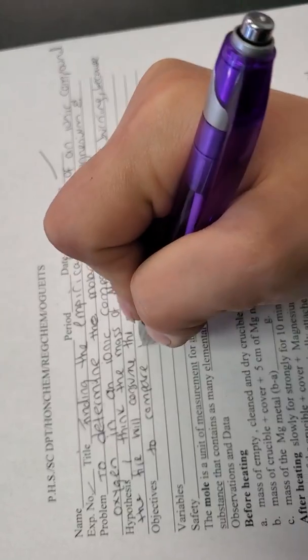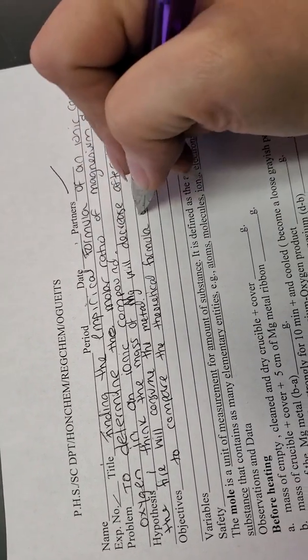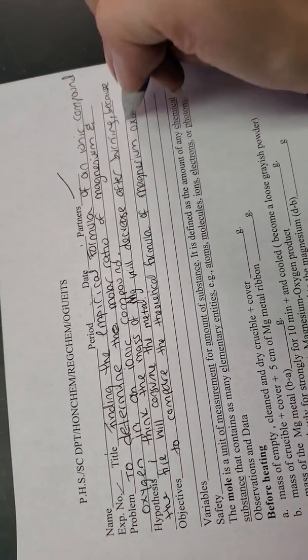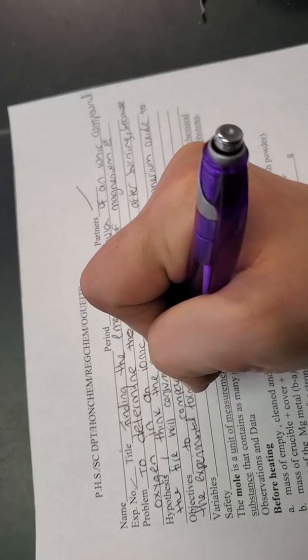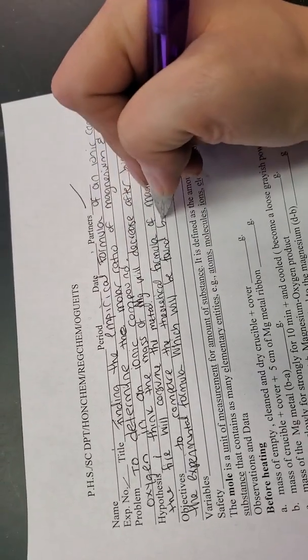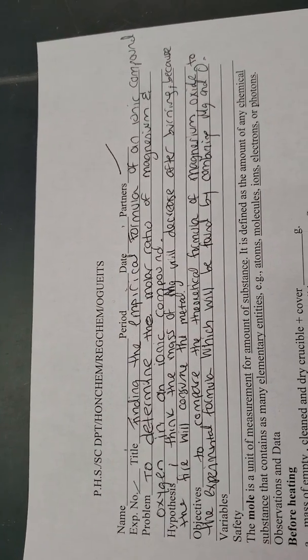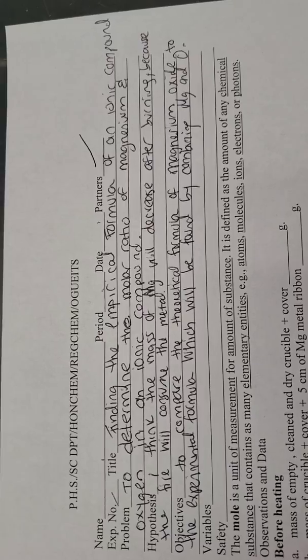All right, my objective is to compare the theoretical formula of magnesium oxide, the compound that we're going to form, to the experimental formula, which will be found by combining magnesium and oxygen. Okay? So the objective is to compare the theoretical formula of magnesium oxide to the experimental formula, and the experimental formula will be found by combining magnesium and oxygen.